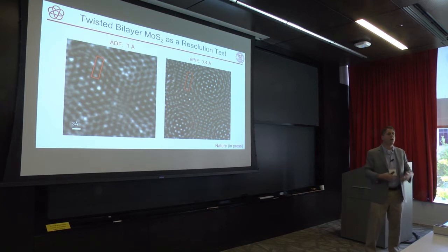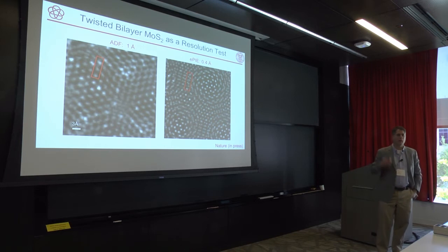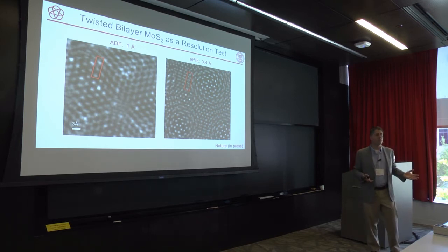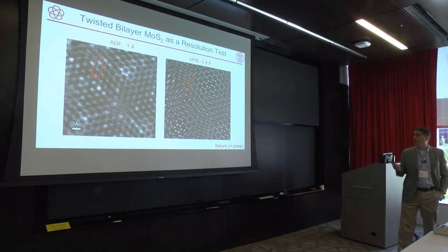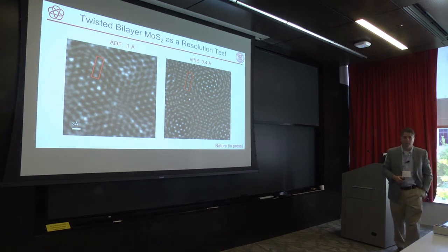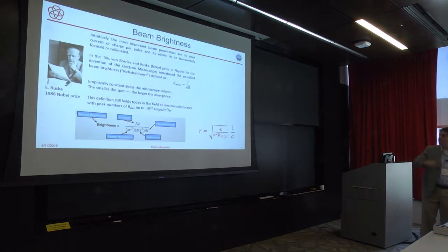If I have an STM, I know where the electron cloud is, but I don't know where the nucleus is. And so a lot of work on high Tc superconductivity is only half the story, because you're looking at the electrons, but you're not looking at whether the ions are following the electrons or not. And so that, I think, is going to have a very big impact on the field, at least I hope so.